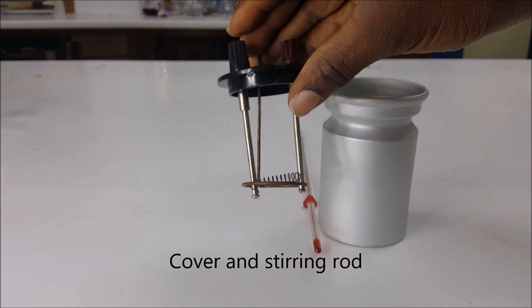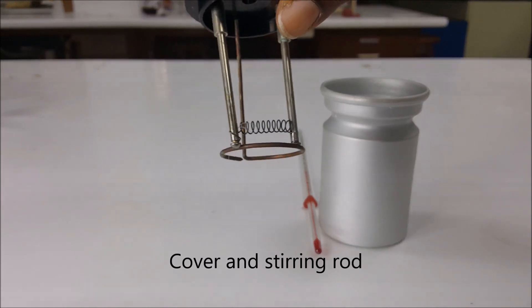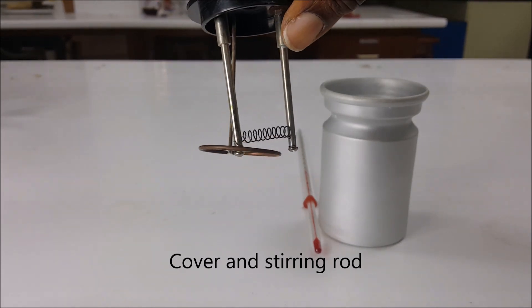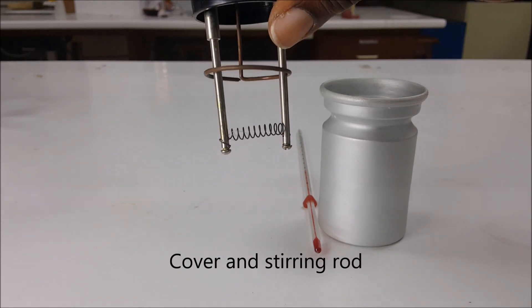You have your cover and stirring rod, or your cap, and that keeps the heat from escaping into the atmosphere around. You can stir the solution inside using the stirring rod or stir bar.